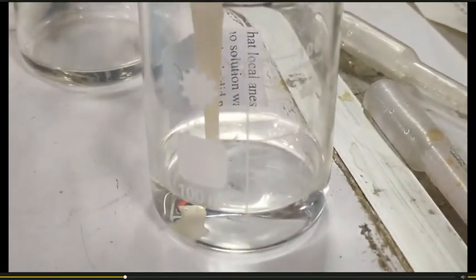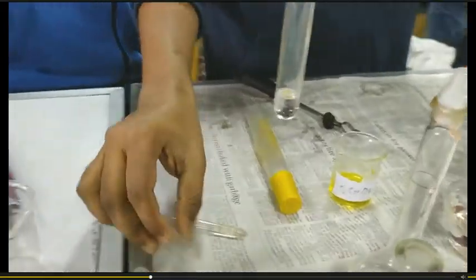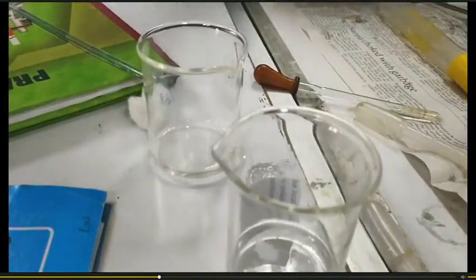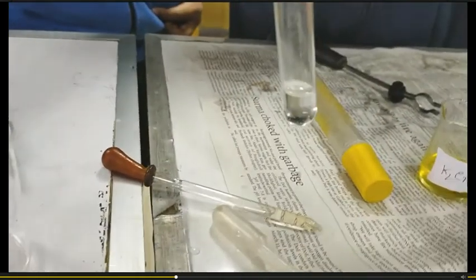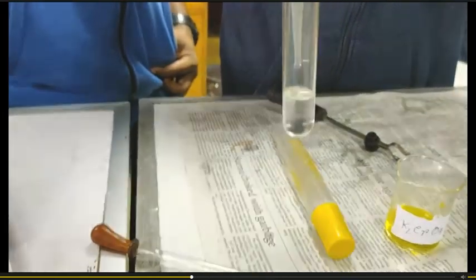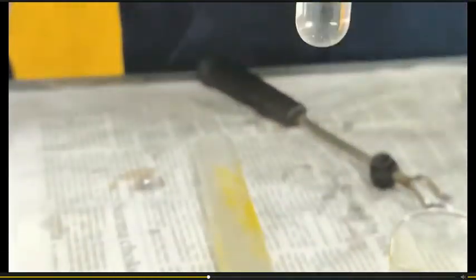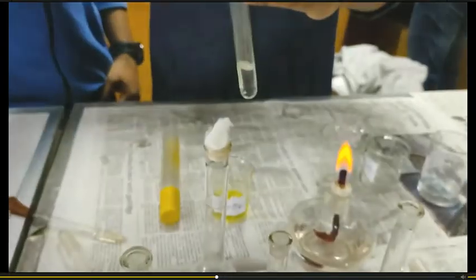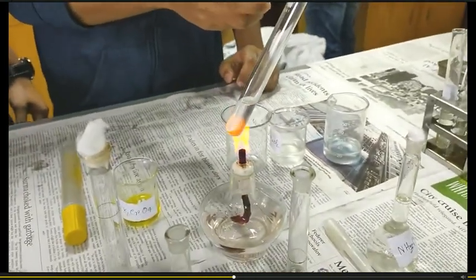We are taking another 2 ml sample for another test of NH4 plus, that means ammonium solution. Into this solution we are going to add 3 ml sodium hydroxide solution. This is concentrated sodium hydroxide solution, into this test tube. After this addition, we will heat the test tube. We are heating the test tube.